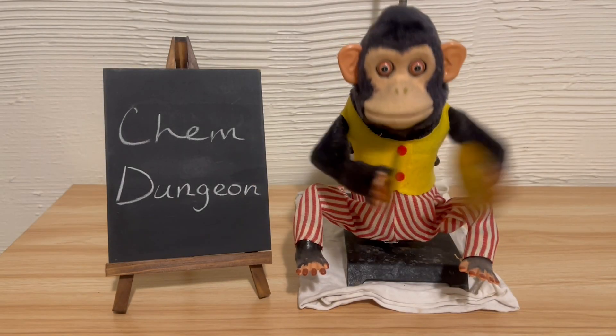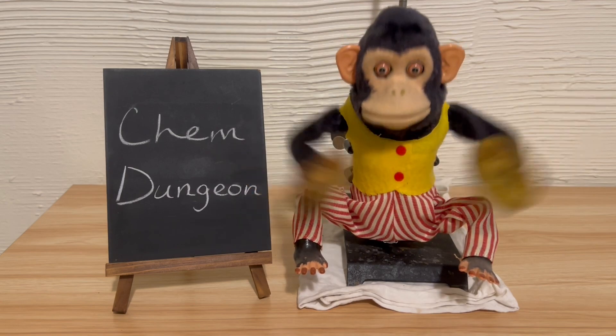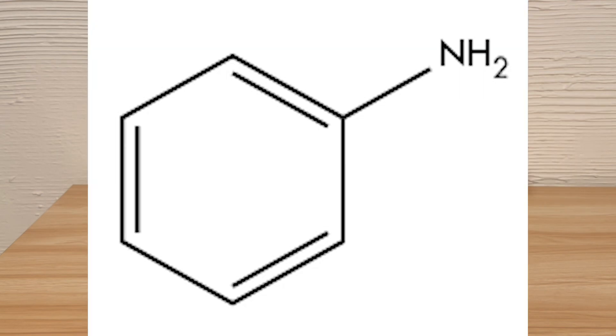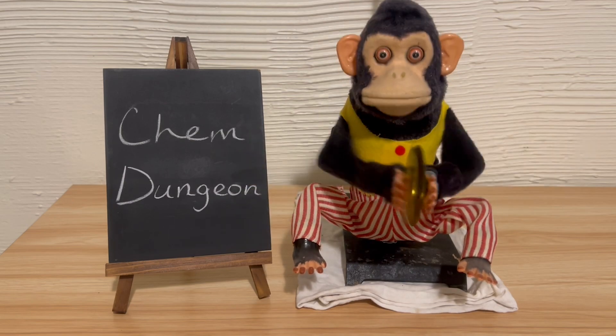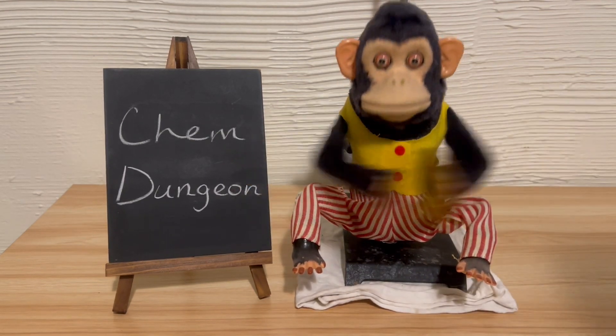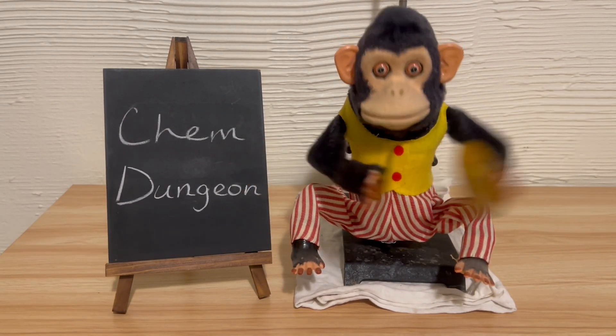Welcome back, y'all. In this video, I'll be freebasing aniline sulfate, which is a misleadingly clandestine wording of a neutralization. Aniline sulfate is the sulfate salt of the organic base aniline formed by the combination of aniline and sulfuric acid. Since there's a lot of reagent preparation behind the scenes that up until now I haven't thought would be interesting enough to put in a video, I thought I'd try it out.